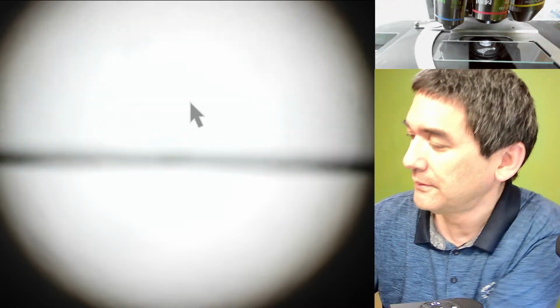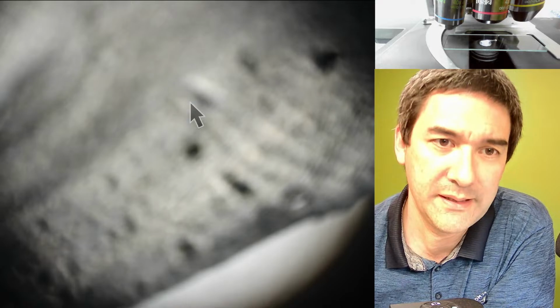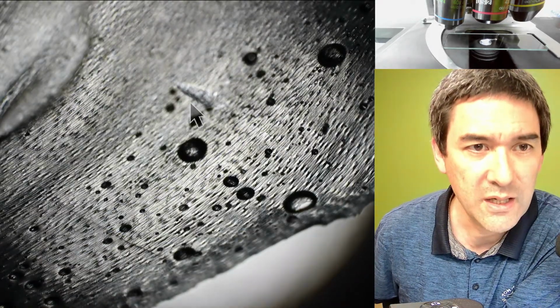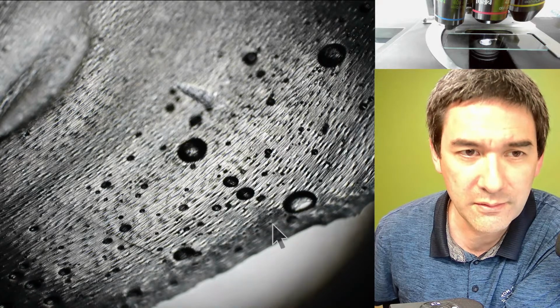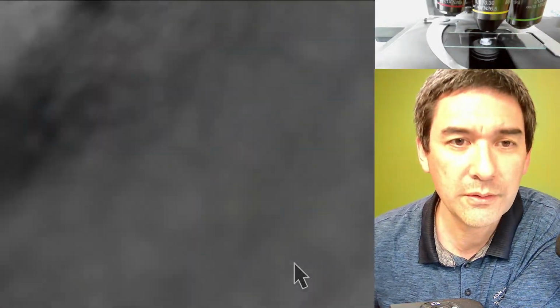Okay, that's a little bit. Yeah, I do see something, but let's see if this is something interesting. I do see something. Yes, and it looks interesting. Okay, those round things, these are bubbles. Forget about those. Let's go up with the magnification.